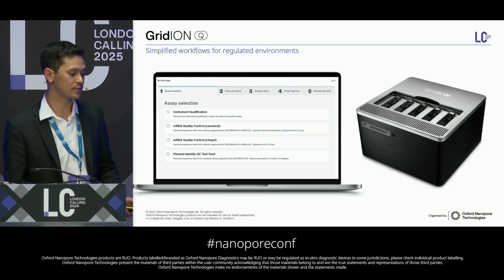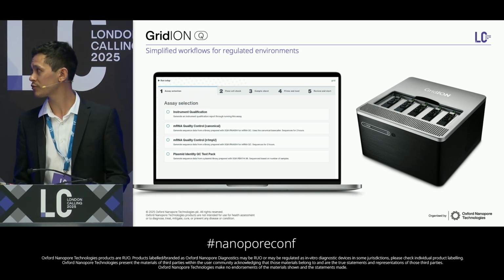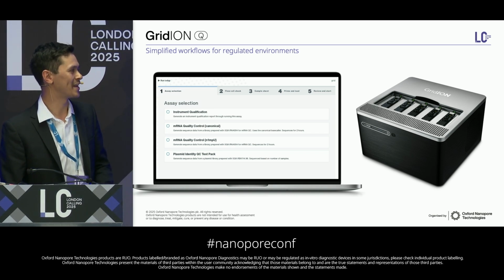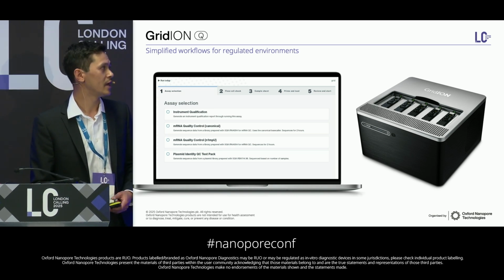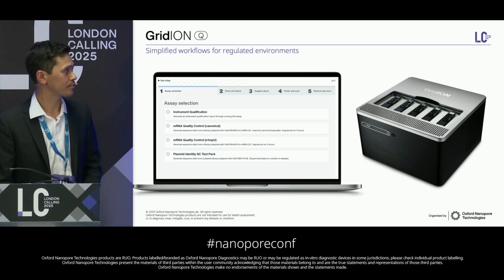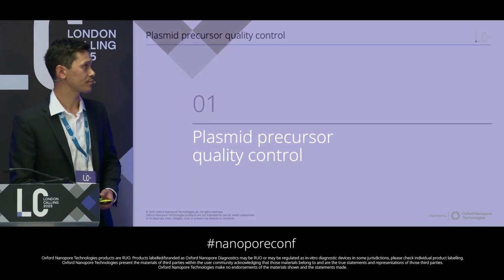The user interface of these devices is much simpler, where a user simply selects which assay they want to run, and it will integrate the sequencing, base calling, and analysis into one streamlined process, and that ensures consistency across analytical runs. So now I'm going to talk about the analysis part of each test, starting with the plasmid precursor.